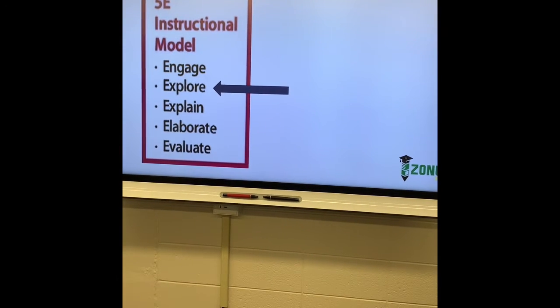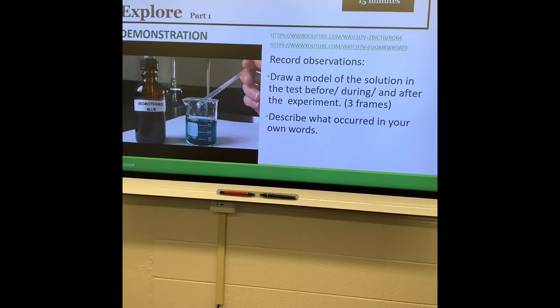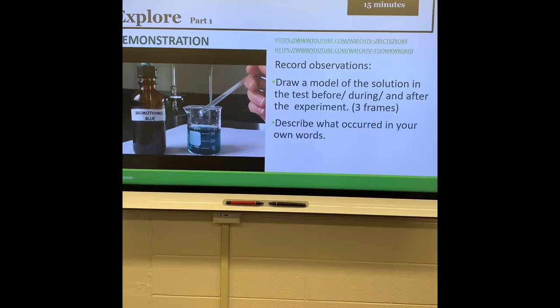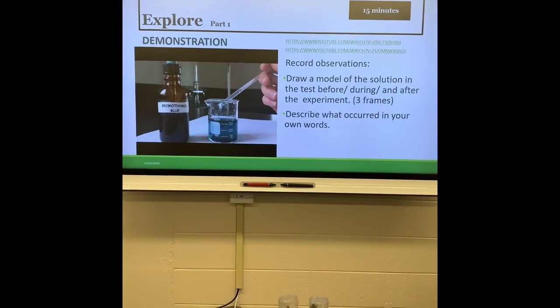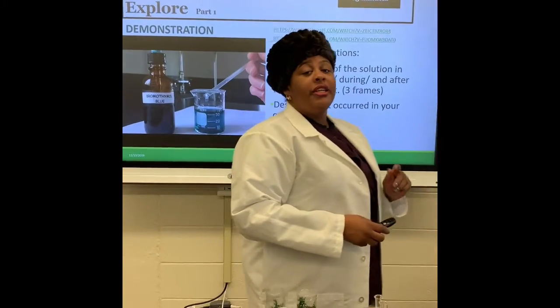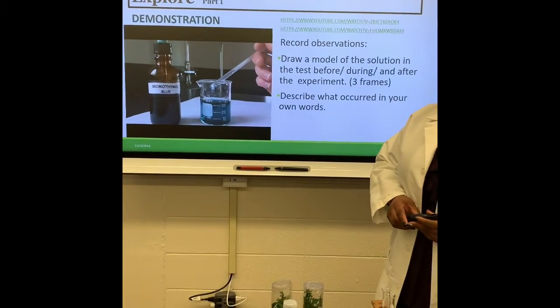All right, we're excited. We're ready to move into our explore phase. And students, you are in your groups of 4. We're going to start off with the lab today, where we're going to be doing a teacher demonstration first. Our explore phase is going to have 3 different parts, and part 1 is going to be our teacher demonstration.